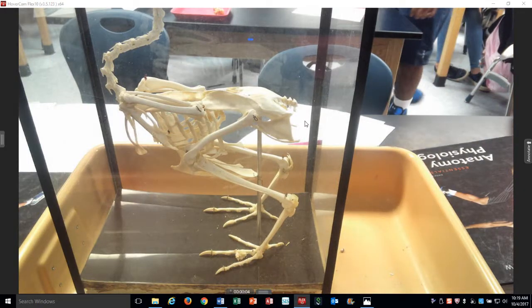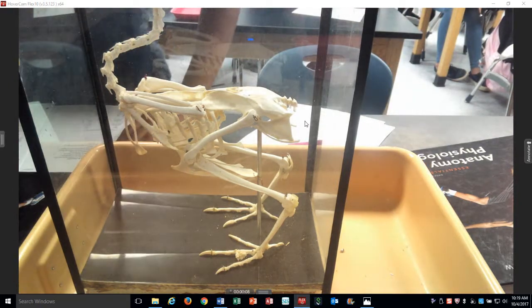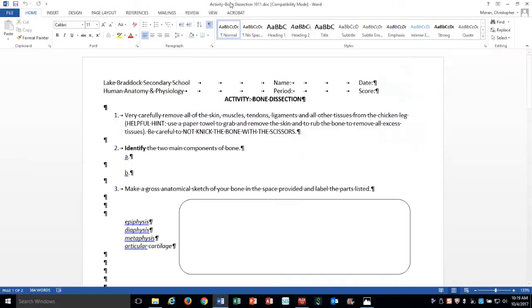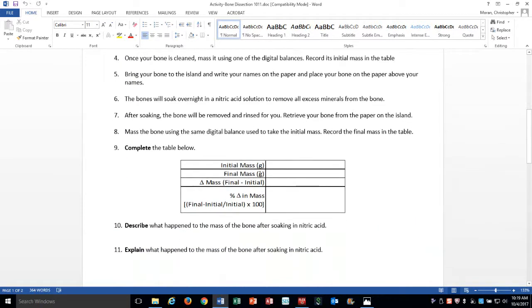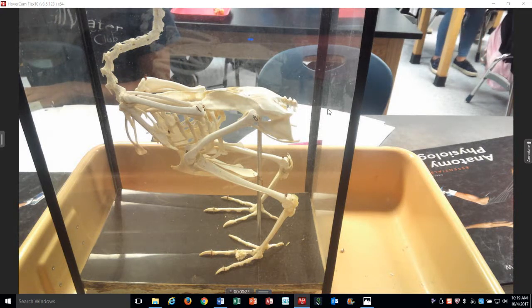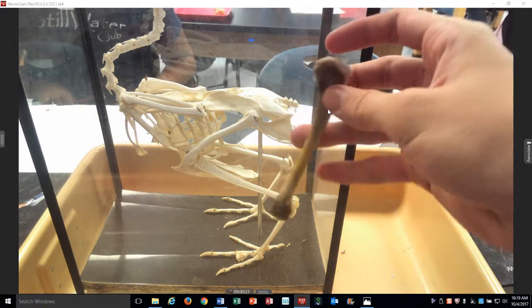All right, so here's the chicken skeleton, or a bird skeleton. What we have done is we are doing this exercise where we're going to dissect the bone. Day one, we're going to get our initial mass, and this is what we did. Most people just take all the flesh off — we started to cook it and eat it.